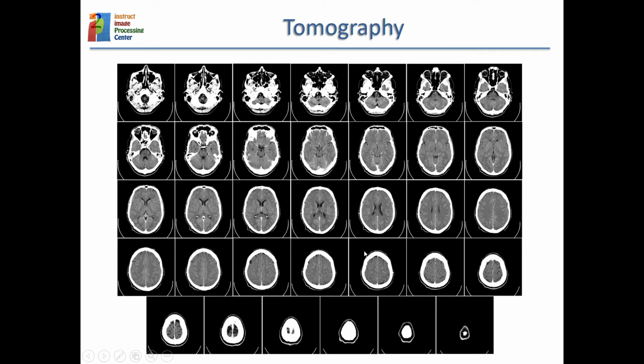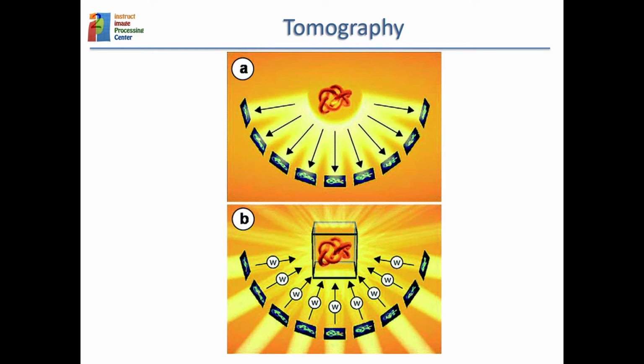That is a signal of what we call overfitting. Overfitting is model bias in CryoEM, where you have aligned your images in such a way that these stripes are reinforced, and that is a mistake.